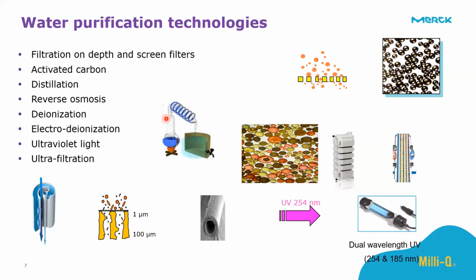And it's not easily controlled, because once the water leaves this point here, you cannot guarantee the quality of the water coming out. Also, there is no technology really to monitor this process of purification. However, it still remains as one of the purification technologies around.